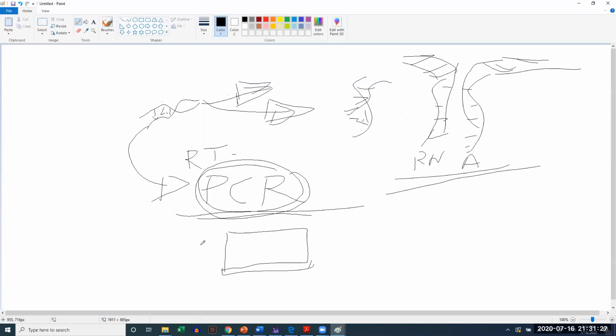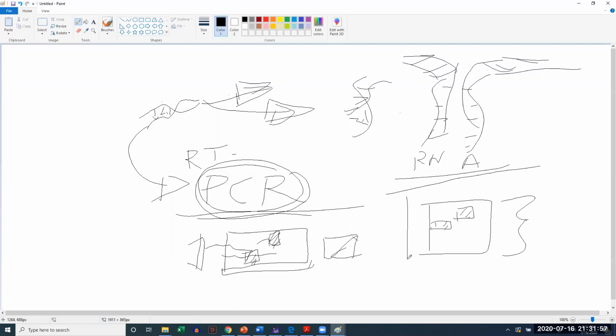We apply roughly 200-volt DC on both sides of the gel, and then DNA tries to pass through this gel, and depending upon the type of the DNA, it gets stuck at a certain point and doesn't go further. Once we see this gel under UV, wherever that particular DNA is, there will be a band appearing. So basically, our process starts from here.